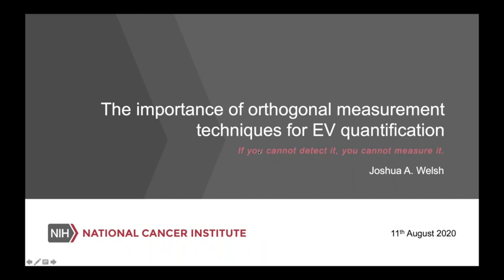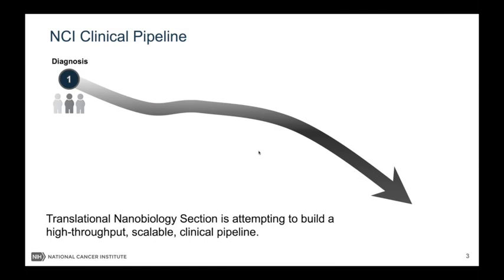Okay, hello everyone. Thank you to Spectradyne for inviting me to talk today. So today I just wanted to take you through our experience with using characterization techniques, orthogonal measurements, and why they've been very important to us, and why we recommend that all people doing EV studies use orthogonal measures.